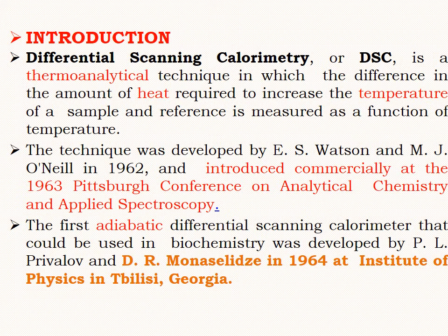If you have a polymer, the heat capacity tells how long the polymer can withstand heat, and what transition occurs on applying this heat. So the thermal transition of the polymer can be studied through this, and also the glass transition temperature, how exactly the glass will be remolded into some other form, right? We can find show pieces in our classes and in laboratory classes, in households, for showcasing, which we often make from glass, right? Those are made because of the glass transition temperature. And also the melting point of each and every component we can identify.